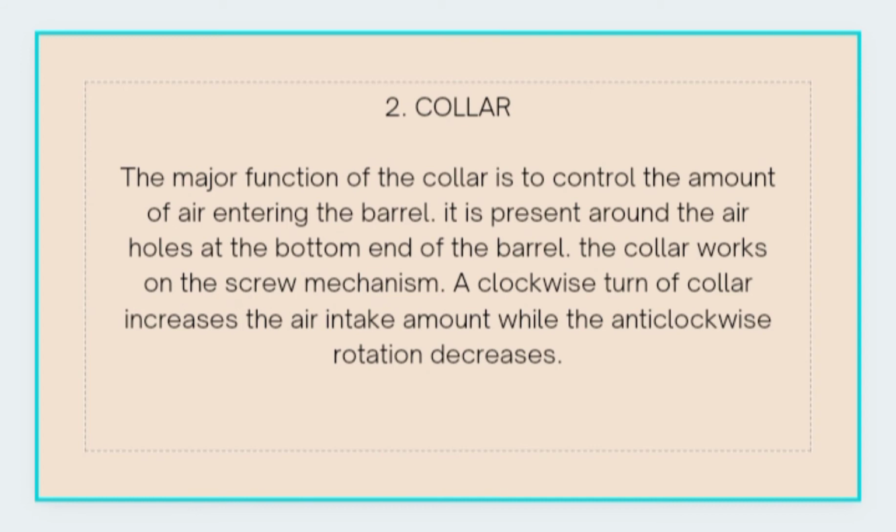It is present around the air holes at the bottom end of the barrel. The collar works on a screw mechanism. A clockwise turn of the collar increases the air intake amount, while an anti-clockwise rotation decreases it.